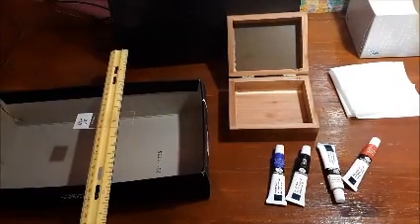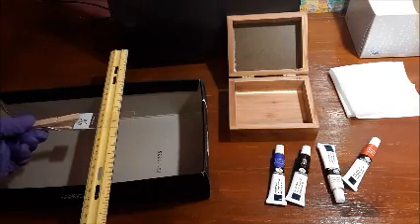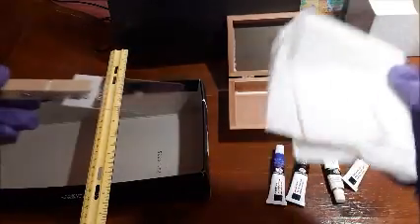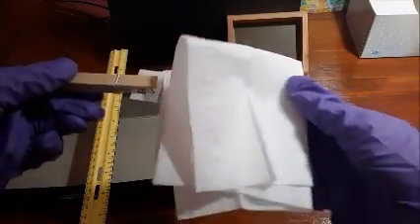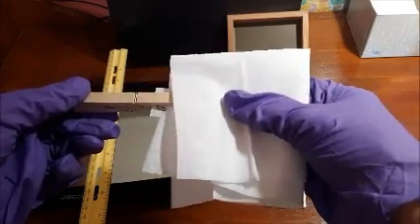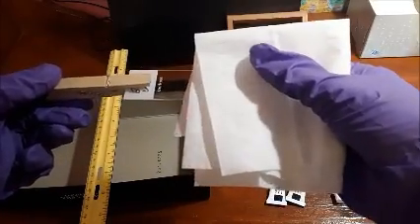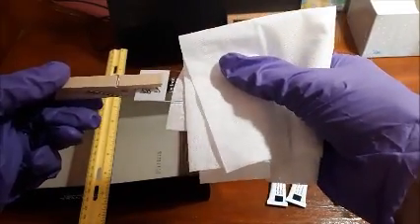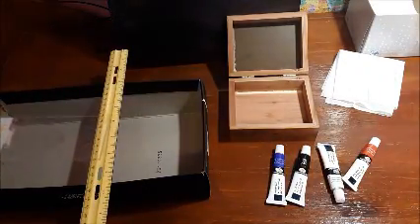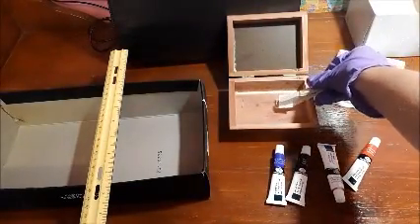Now that all the stains have been applied to the smear and it has been rinsed off, you can now blot dry the slide using your book of bibulous paper. So what you're going to do is put it in gently and just gently rub the slide in to dry it off. Put that down, and then once you're done, just put your slide in the slide box for safekeeping.